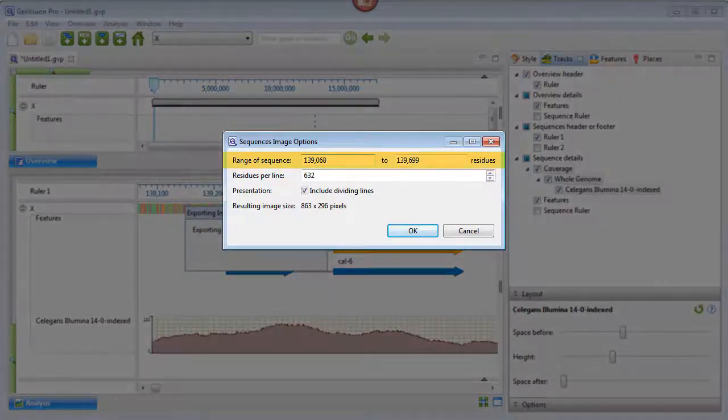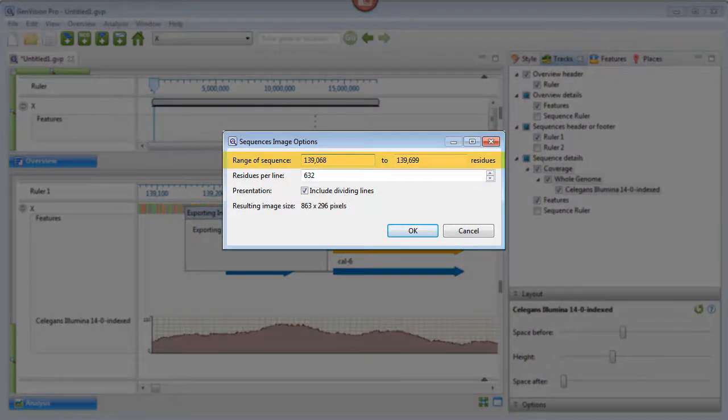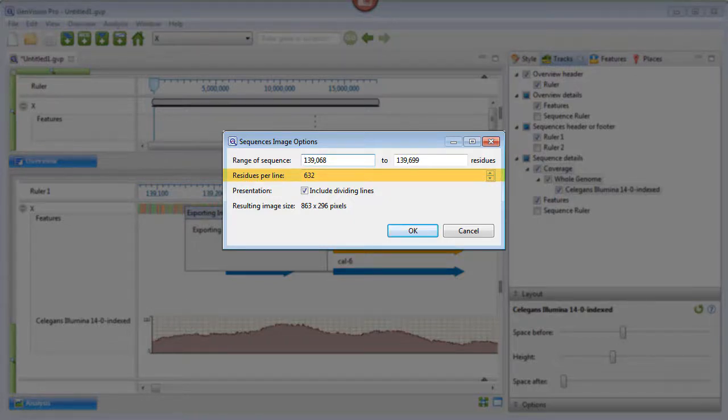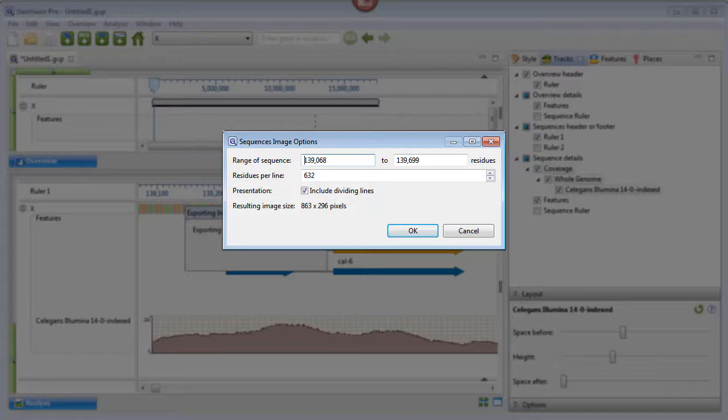The pop-up shows the range of sequence that's currently visible in the analysis view and the number of residues that will be displayed on each line in the image. I could change these as desired, but I'm going to leave them at the defaults and just press OK.